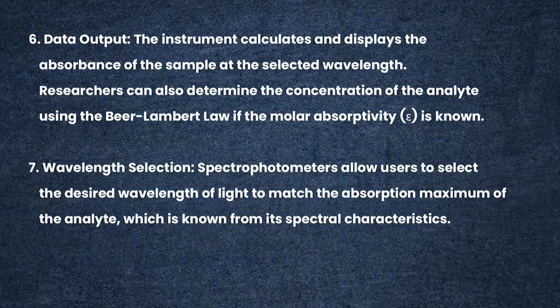Next is the wavelength selection. Spectrophotometers allow users to select the desired wavelength of light to match the absorbance maxima of the analyte, which is known from its spectral characteristics.